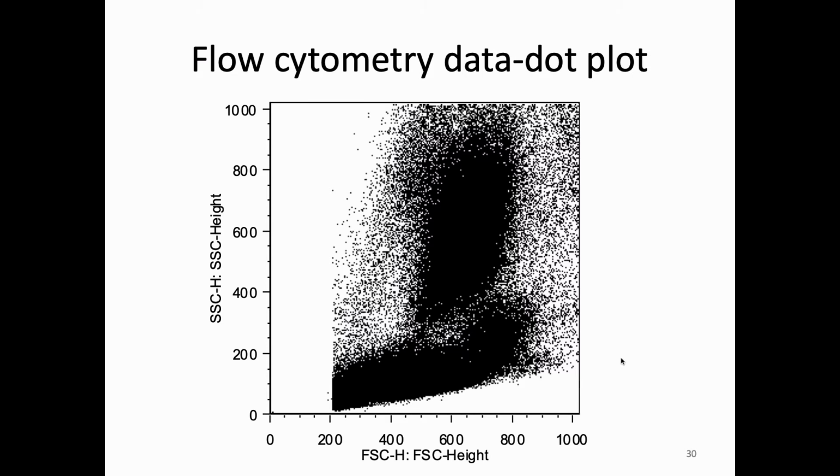When you start getting higher in the number of colors, there will also be situations where you don't use all of them, but you think about which ones work together the best. So it's giving you more options in terms of things like overlapping signals and things like that.